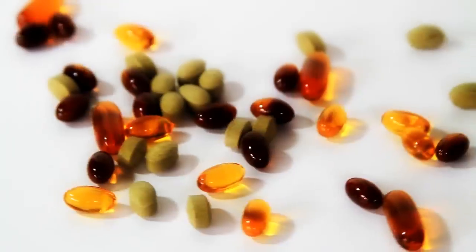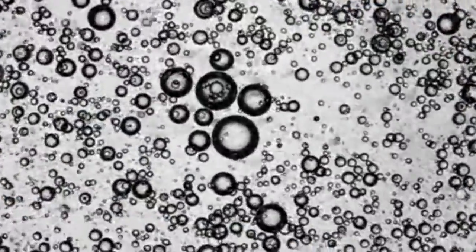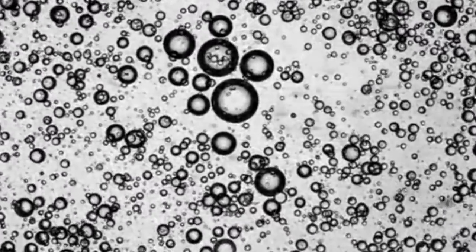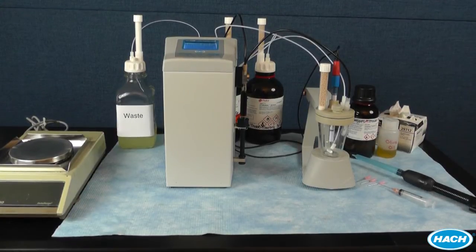Karl Fischer titrations are used for measuring water content of solids and liquids. They are commonly performed in the pharmaceutical, cosmetics, food, and petrochemical industries. The Hock Titrolab Karl Fischer titrator provides a fast and easy method for performing routine volumetric Karl Fischer titrations. It can measure water content from 100% down to 0.01%, or 100 ppm. Its sealed titration cell along with automatic fill and empty pumps minimize errors due to water ingress and limit solvent odors. The purpose of this video is to demonstrate the operation and verification of the Hock Titrolab Karl Fischer titrator.